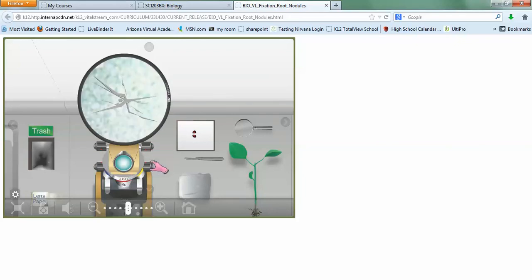I broke my slide because I was on 40. You should have it on 4. So you're going to adjust it by going like this, and then do your fine adjustments down here. So you're going to hold the knob, but you're just going to move your mouse back and forth. And you're going to draw what you see.